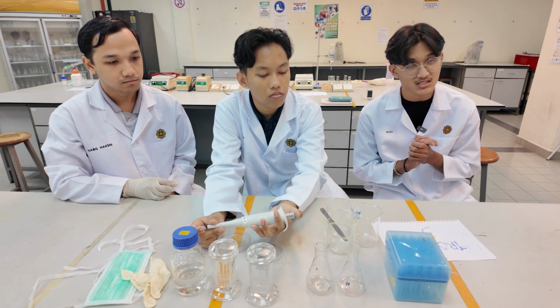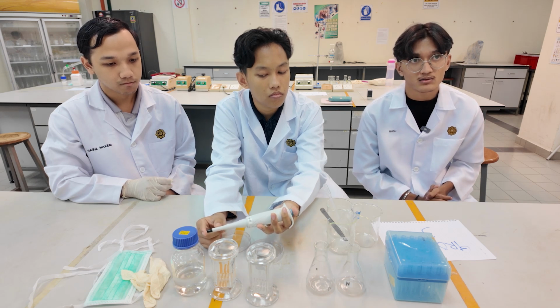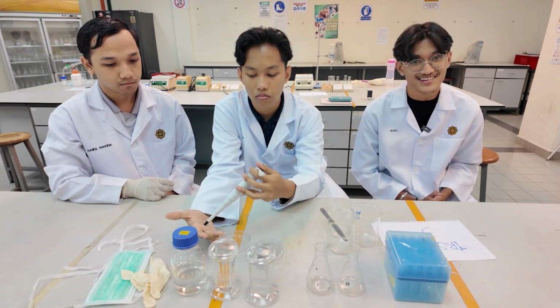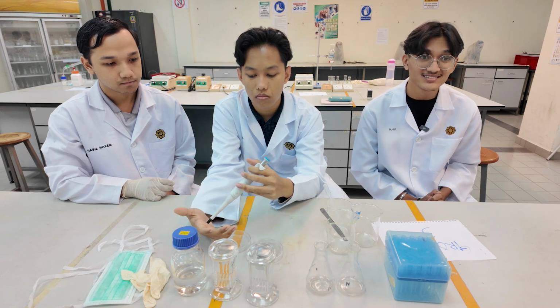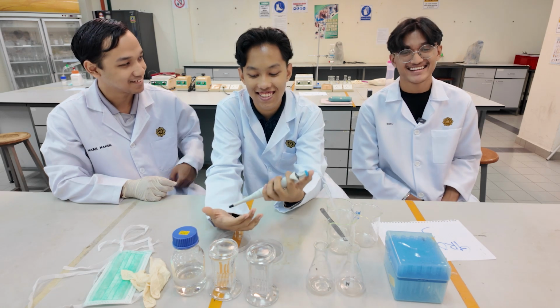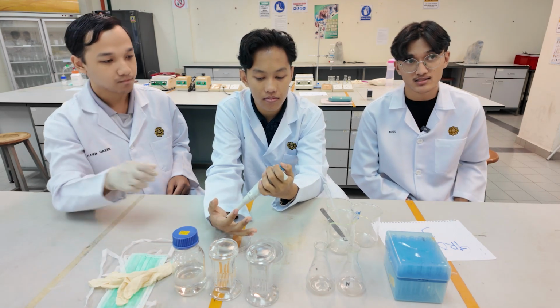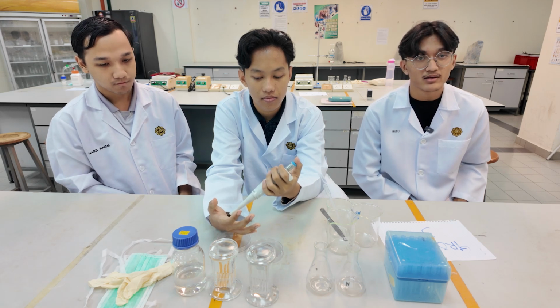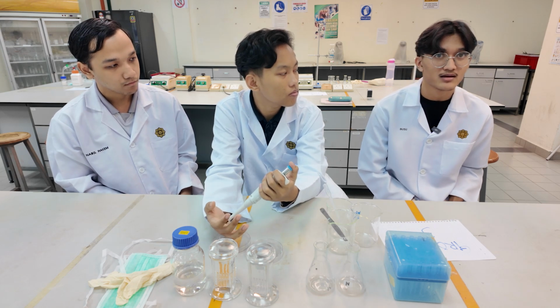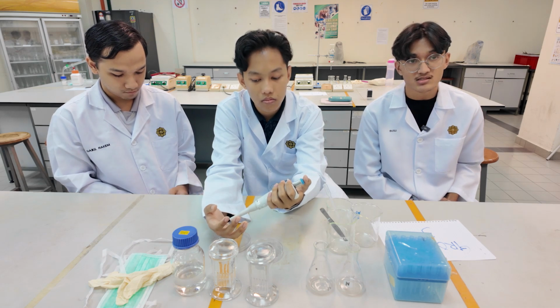Okay, we move to the second part, which is the food industry. For the food industry, we use TLC to check whether there are any additives, contaminants or toxins in the product. Okay. For the first example, we use TLC to check whether there are any harmful substances, such as aflatoxin, which is produced by the mold in nuts or grains.